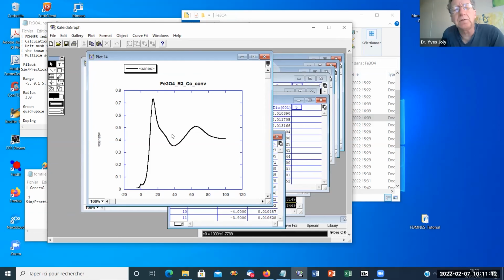Okay, so I think sometimes people like to calculate this kind of thing. After, if the doping is too much, for example, you could have some structure with 30% of some element and 70% of other elements. In that case, often it's better to make a superstructure. So you build a new unit cell with a superstructure. It's possible to do that with the code and to mix a bit the different possibilities of atoms in some average way that you choose yourself. So it's more precise.